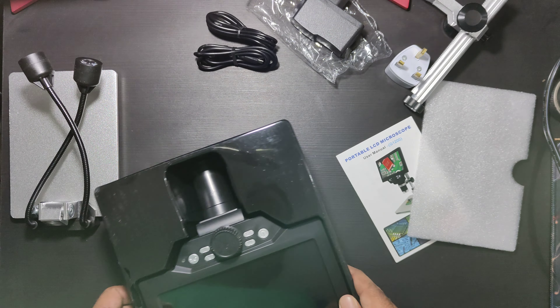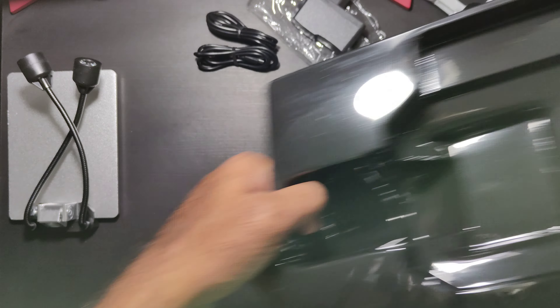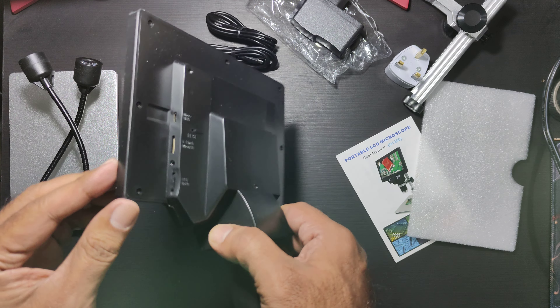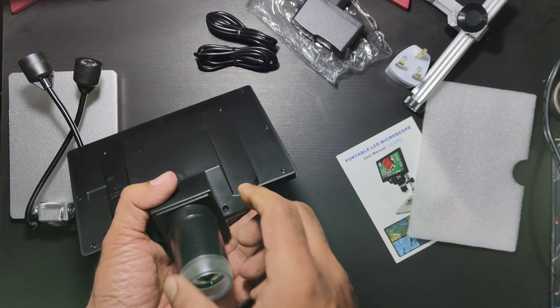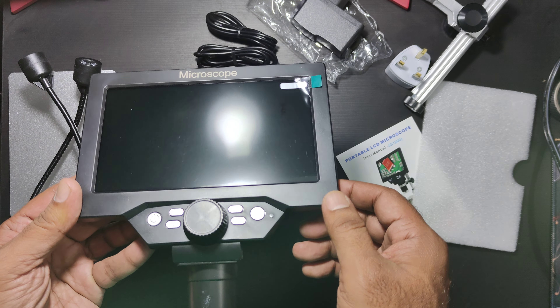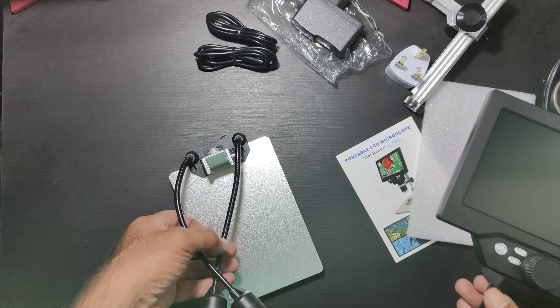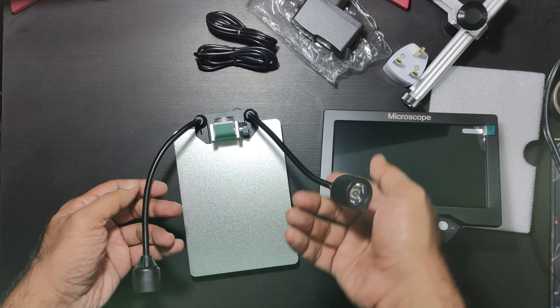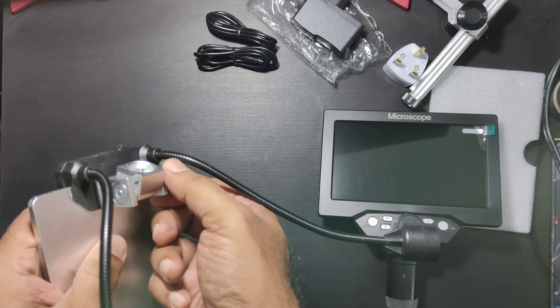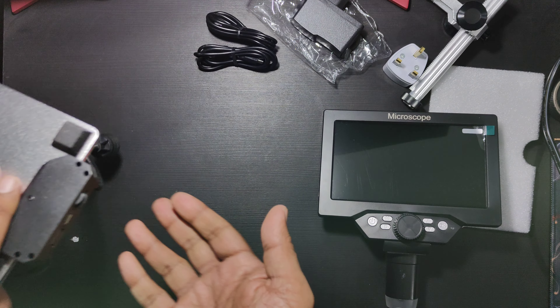This is the holder and the ratchet mechanism — oh, nice! There are two micro USB cables, okay that's nice. And this is the base plate along with LED lights. I think this is for controlling the intensity of light.